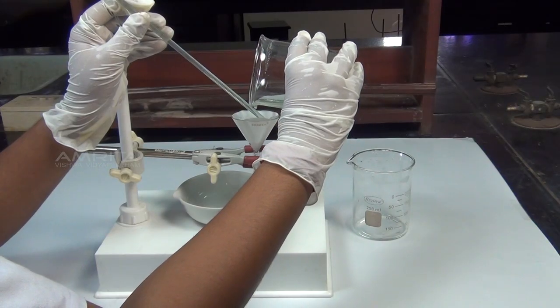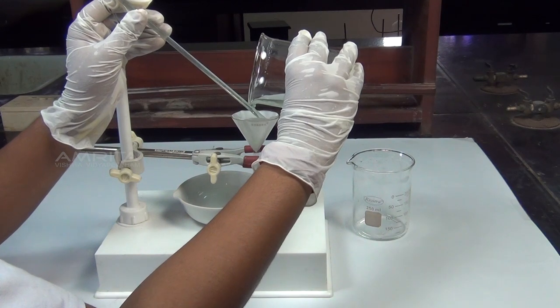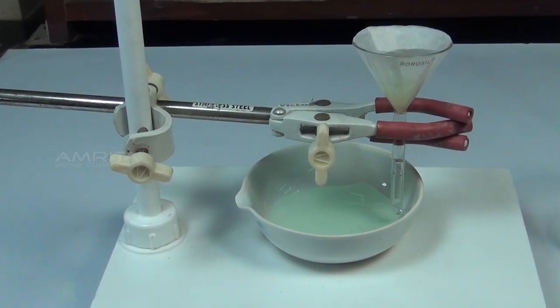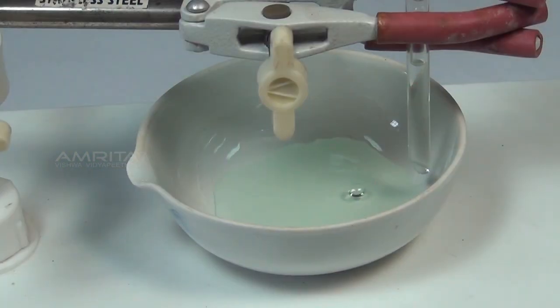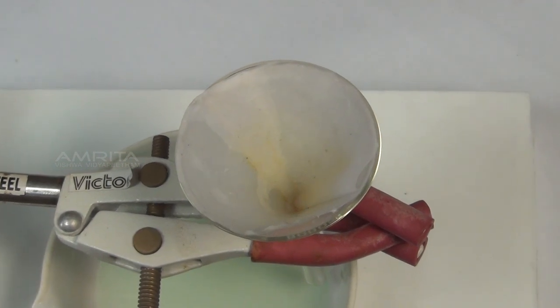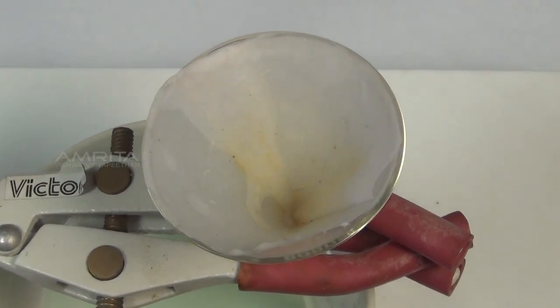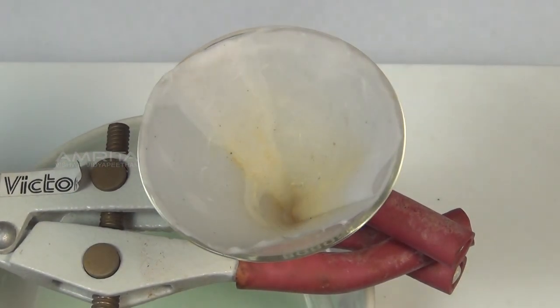Then filter the solution into the china dish using the funnel and the filter paper. The stem of the funnel should touch the wall of the china dish to avoid the solution splashing out. After filtration, the insoluble impurities are left behind on the filter paper.